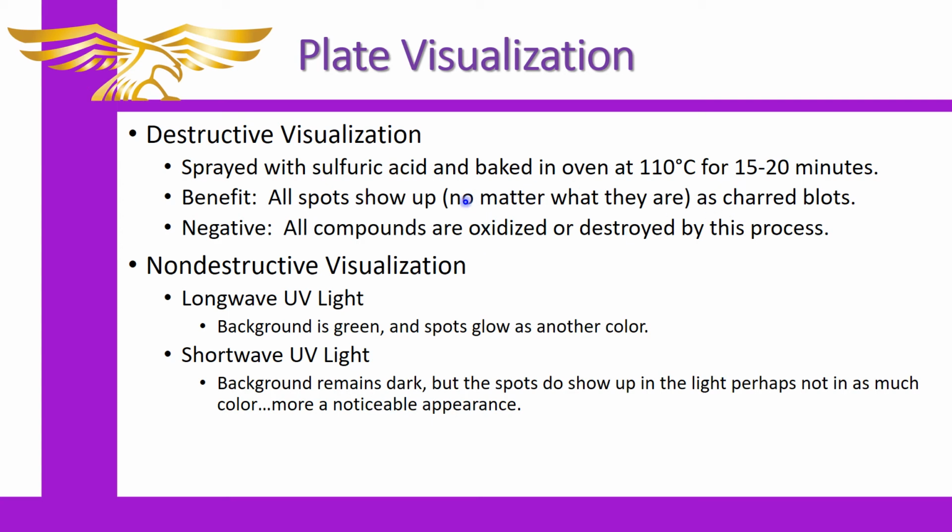There's another one that I put in the notes on this slide, which involves the use of a permanganate sulfuric acid solution in which the plate is soaked and then the back of it is wiped off and sat on top of a hot plate and heated gently until it develops the visualization for you. And it does leave charred bits, so it's destructive as well.